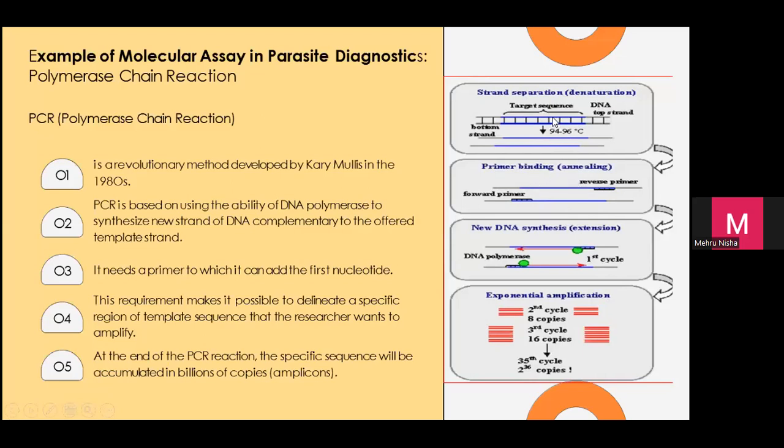Sequence pertama, you pecah dia. Sebab DNA bond memang kuat. How you break it? You put a high heat. Kepanaskan dia. Region yang ni, you kena synthesize sendiri dari company. Kita order dari industri, forward, reverse.